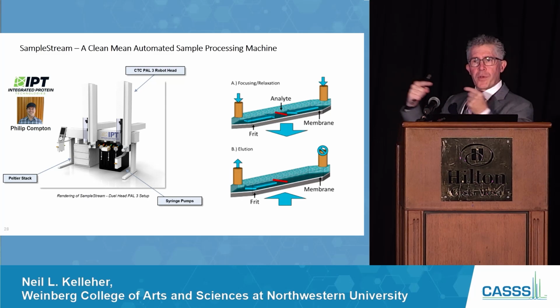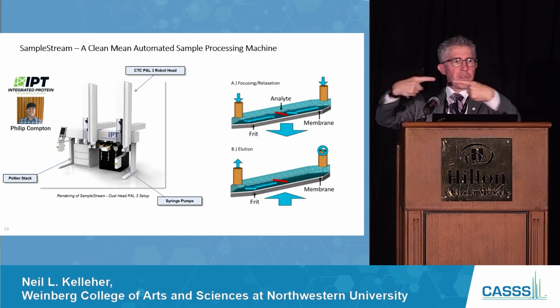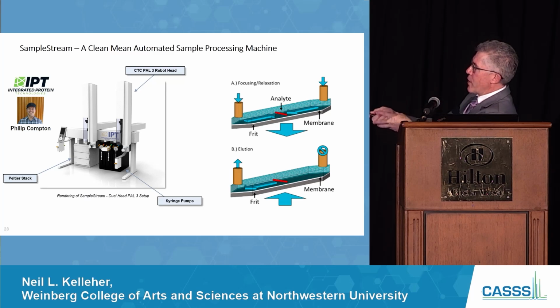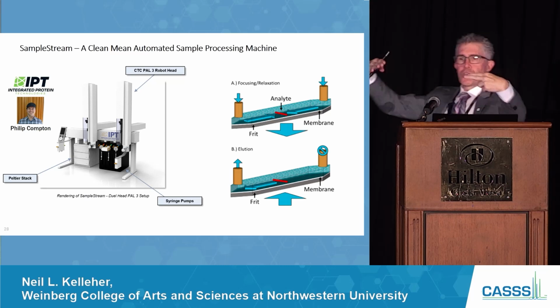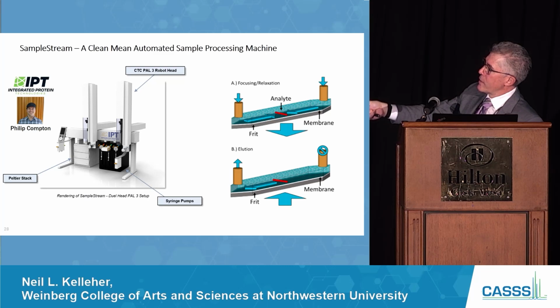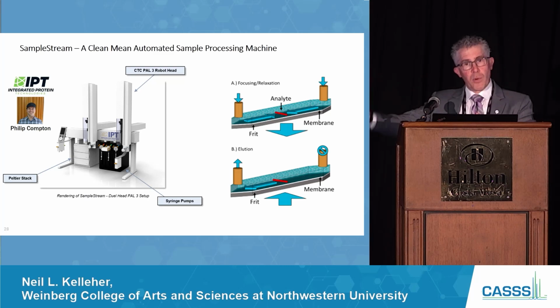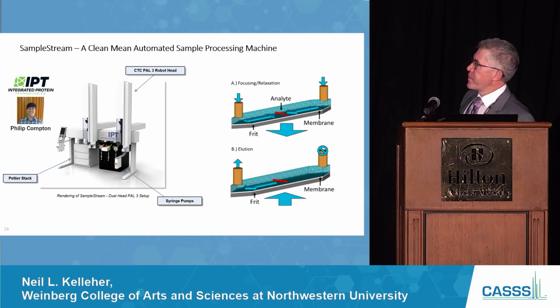It's a form of chromatofocusing that uses 2 opposing liquid flows at 50, 100 microliters a minute, and it creates this concentration effect where, above a molecular weight cutoff membrane, there's downward flow, but the opposing forces of the flow create a very focused analyte band and allow you to buffer exchange as well. So it's a concentration and buffer exchange device. It is meant to compete with things like RapidFire, or in some cases, flow injection analysis, or LC.